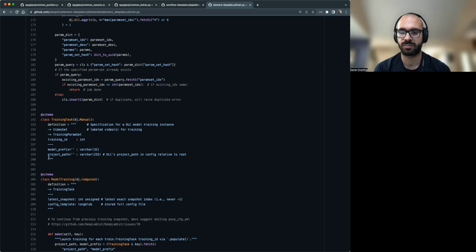The motivation for having that ID is to make it easier, I think, to reference this is my training task instead of having to search upstream for, wait, what exactly is this video? Give me all the details of the param set. It reduces it down to an integer to say, okay, tasks 1 through 5, I know I'm working on this project. Tasks 6 through 10, I'm working on the other project. It could be removed. It doesn't need to be there. For me, it was easier to reference an integer than look upstream.